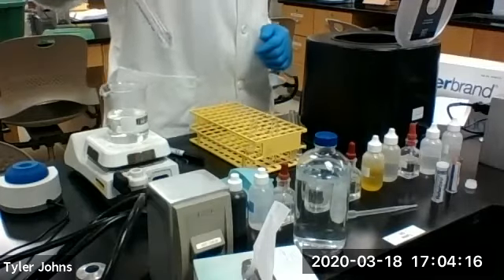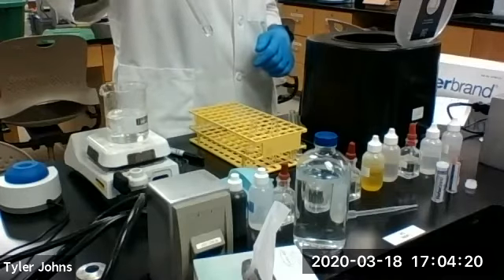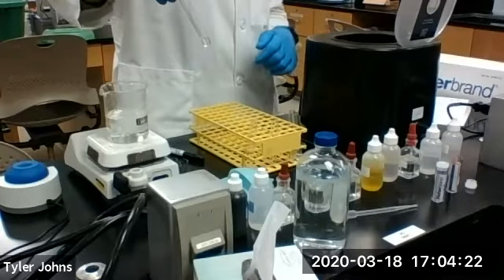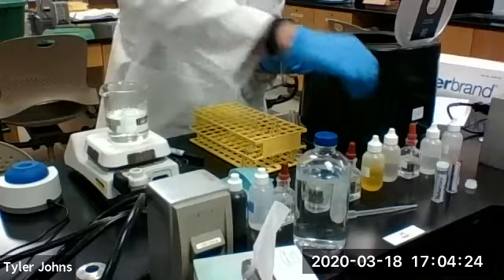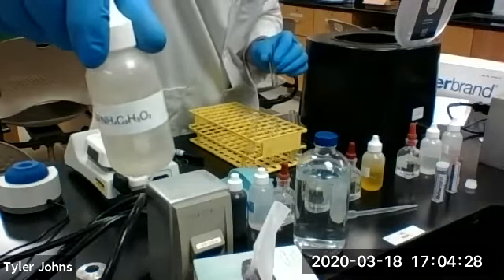To this solution, we are now going to add 5 drops of 3 molar ammonium acetate. We have 3 molar ammonium acetate here.